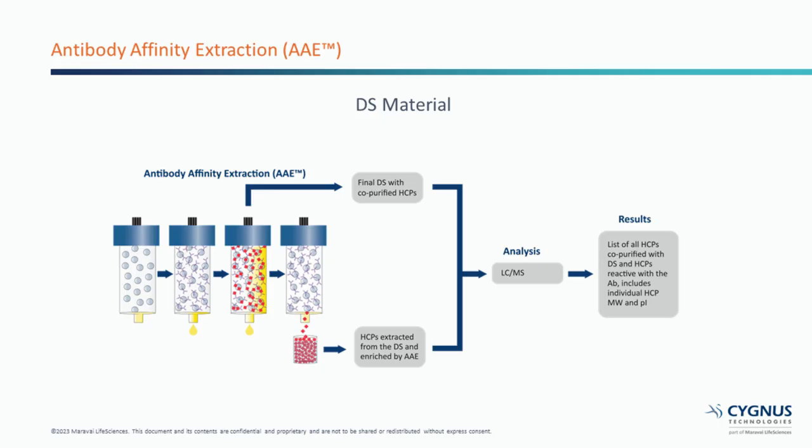So it's all great. I mean, we are done with coverage here. Coverage is obviously very, very important to make sure that you are using the correct ELISA for your process. But it is really those proteins that make it all the way to the final drug substance through a given purification process that are the most important proteins with respect to patient safety and drug efficacy and stability.